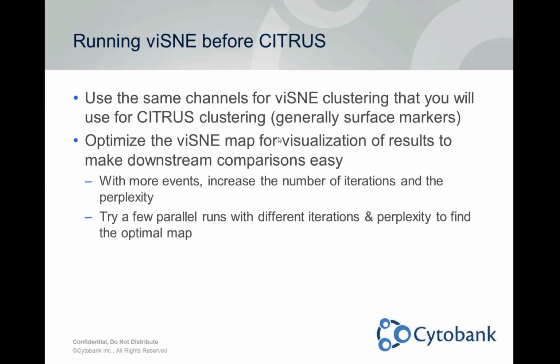And feel free to run ViSNE a couple times with a couple different kinds of settings to make sure that your map looks good. So as you add more events, it's a good idea to increase the number of iterations and the perplexity in the ViSNE.